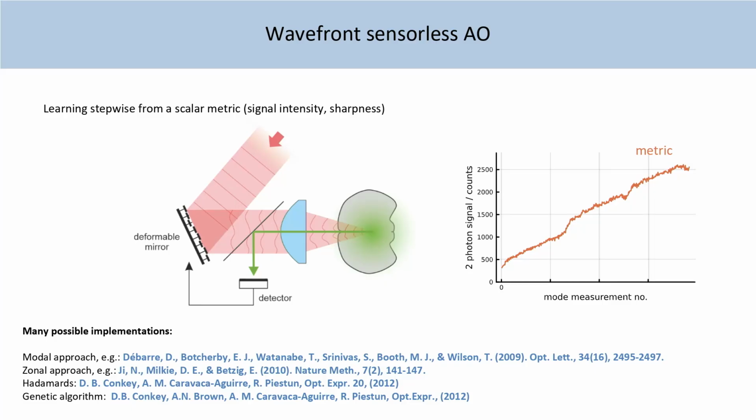So there's direct wavefront sensing. There's also a thing called indirect wavefront sensing, and I would probably say that the majority of systems in microscopy are working with this indirect wavefront sensing strategy. What's so special about it? We don't have a wavefront sensor anymore. Instead, as the name implies, we try to figure out somehow, by iterative measurements on my spatial light modulator, what the aberration might be.